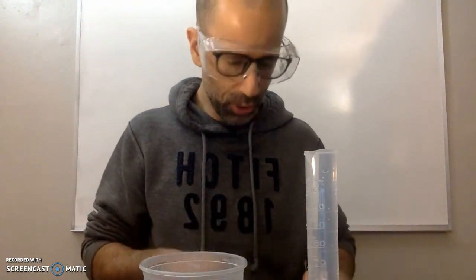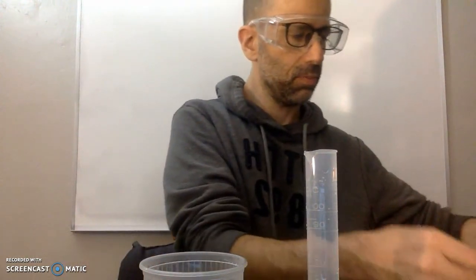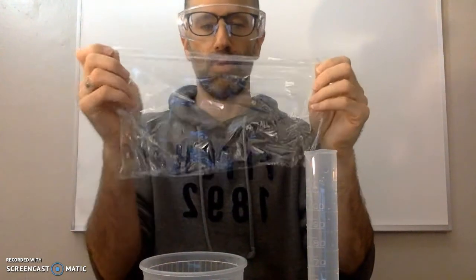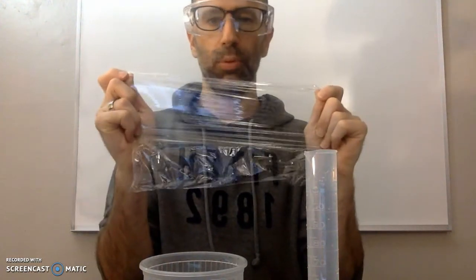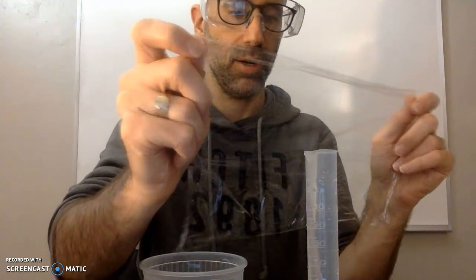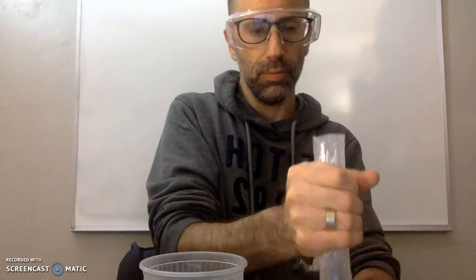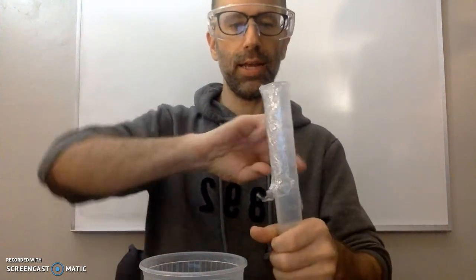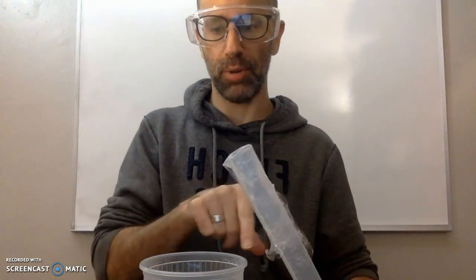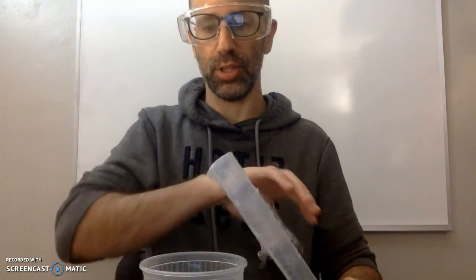Another way is with plastic wrap. Instead of using your hand, place the plastic wrap over the top — don't pull too tight and break it, but create a seal. Then you can easily turn it over and submerge it into the water, and while it's submerged just take the plastic wrap off. You should not lose any of the water inside.